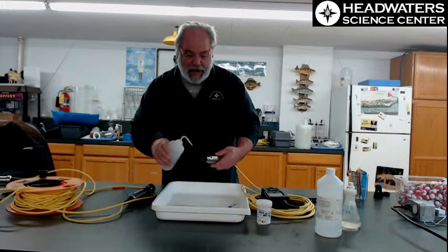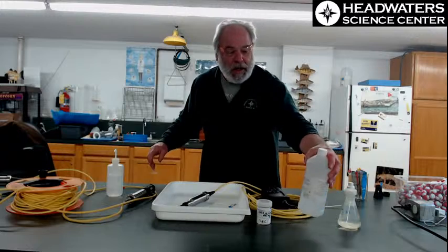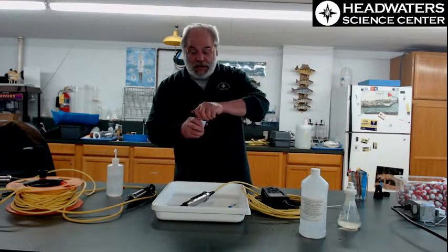All right, so I cleaned that up, rinsed that through, and here we're measuring conductivity. Now that standard came out of this bottle. That's 1,000 microsiemens per centimeter. That's just the unit.